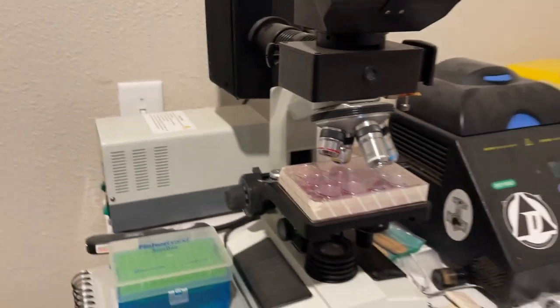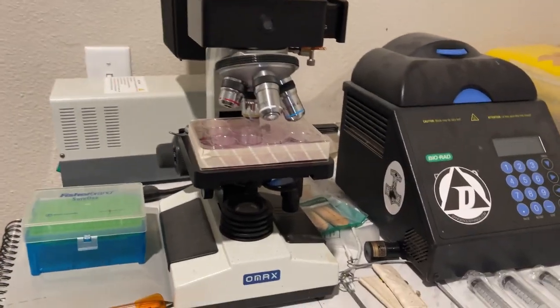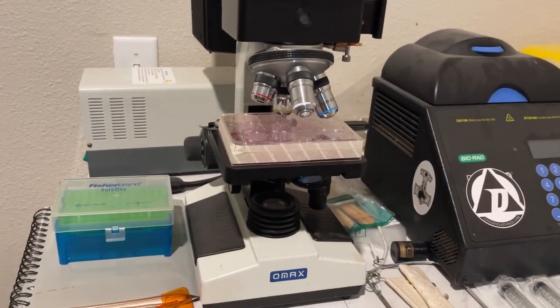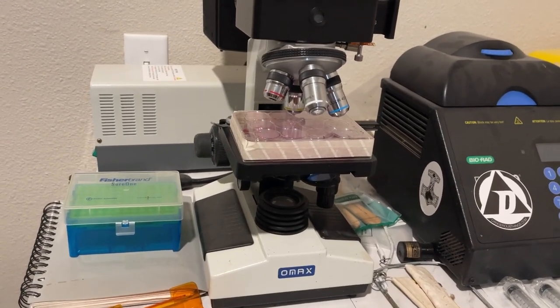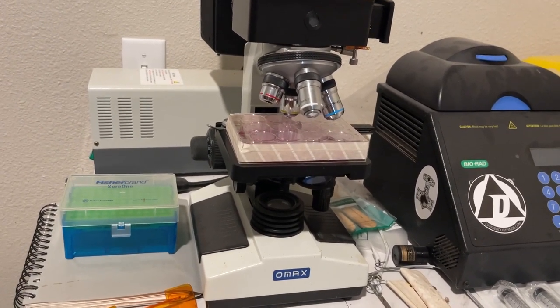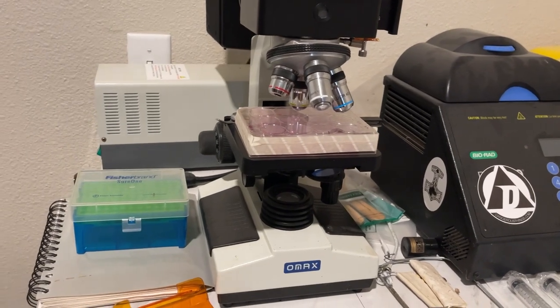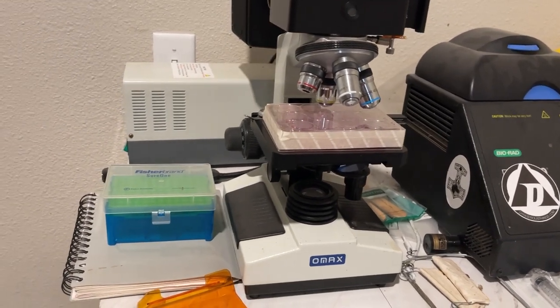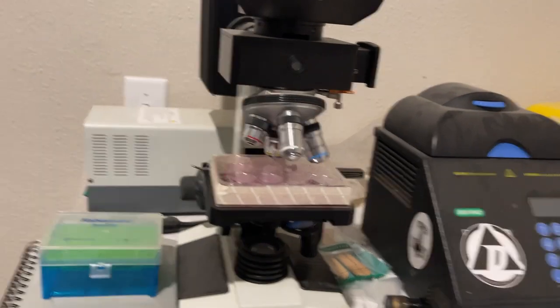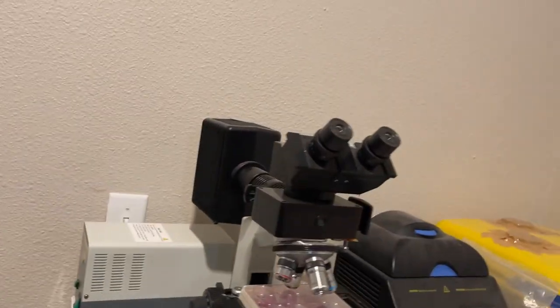That's not a problem if you're willing to scrape cells off and put them on a slide or something, and count them that way. But I want to look at their growth curves over time. I want to be able to check on them, keep growing them, check on them, keep growing them. And that's where, really, you want an inverted microscope.